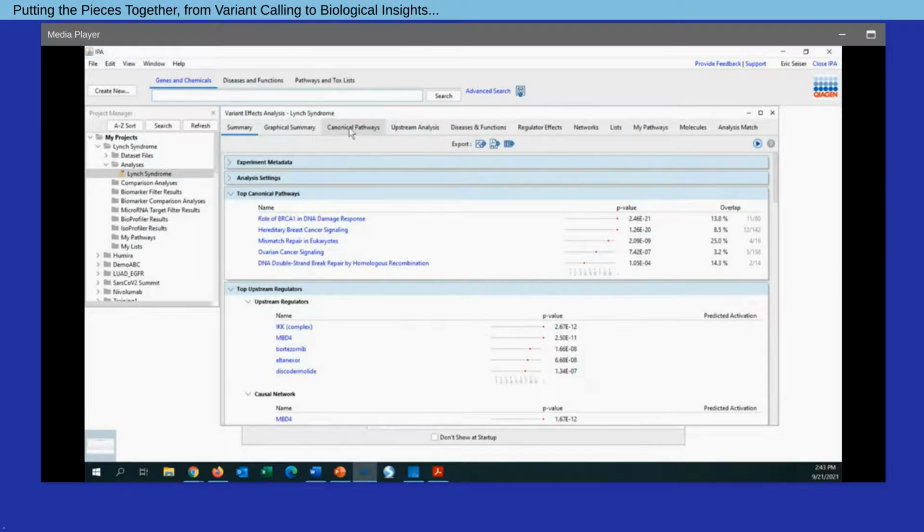When we run this core analysis, we'll get a number of biological endpoints, but one critical one is trying to understand the pathways that are associated with this set of genes that have loss of function variants. So in the summary page of this analysis, the first tab at the top left, what we'll see are top hits with regards to canonical pathways.